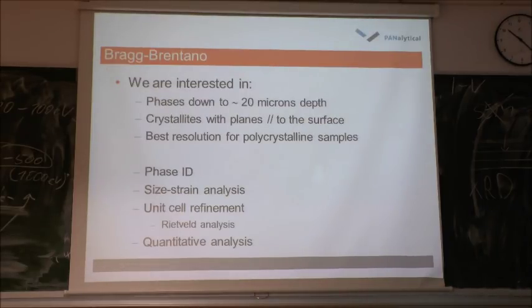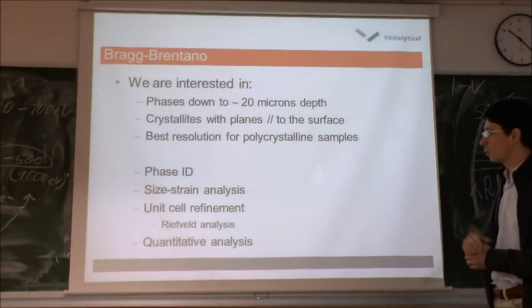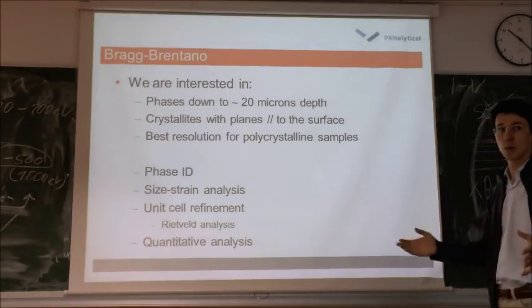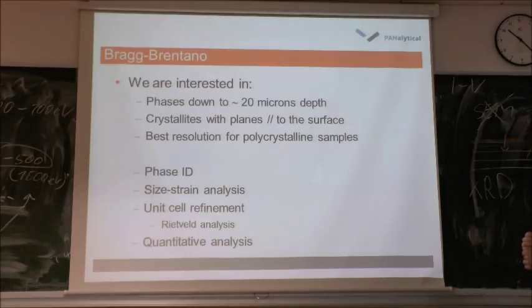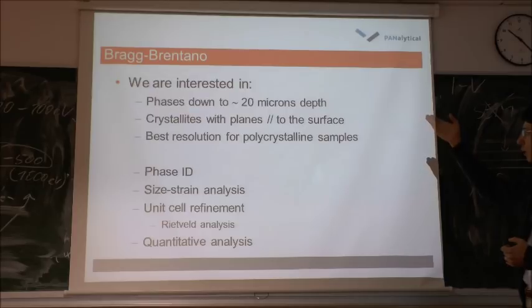Okay, so Bragg-Brentano. Why do we do Bragg-Brentano measurements? These are the reasons which are listed. Normally, with the X-ray analysis, we want to figure out which phases are present in the material that is being analyzed. With this kind of analysis, we can go about 20 micrometers depth into the material.